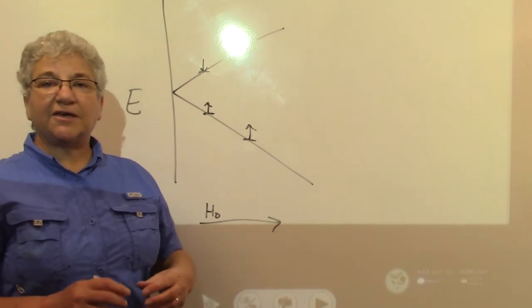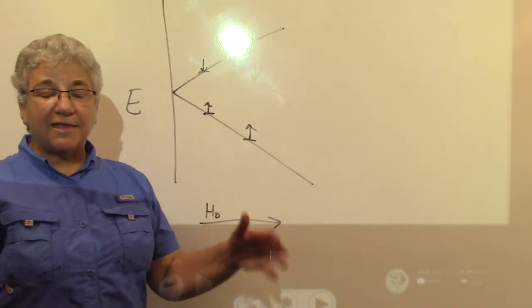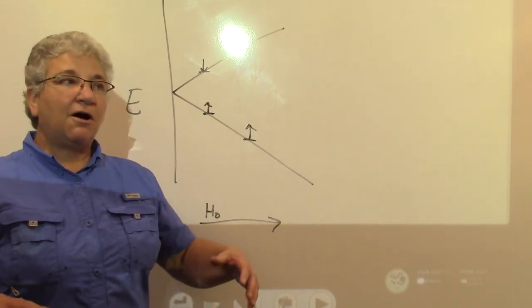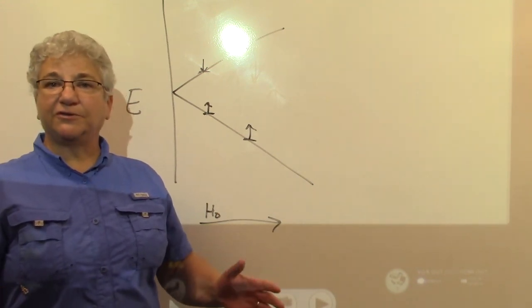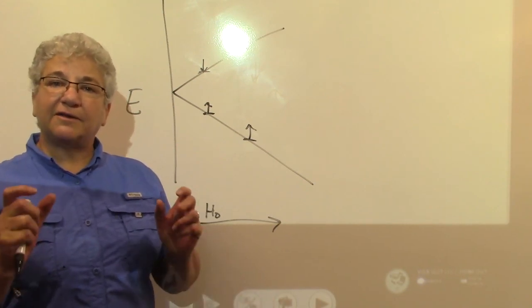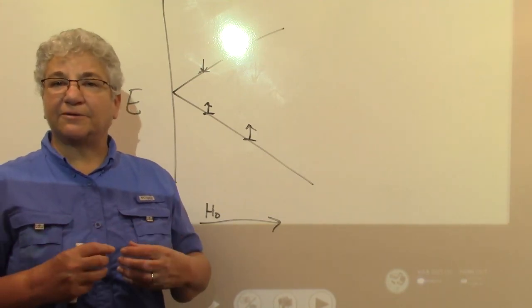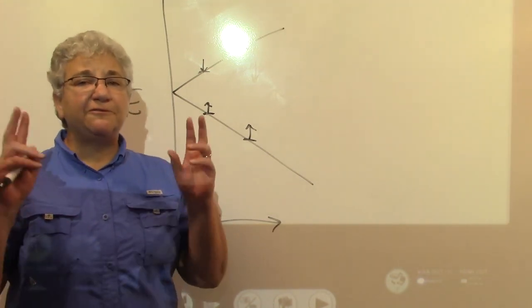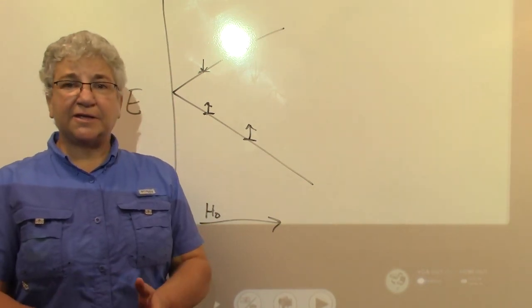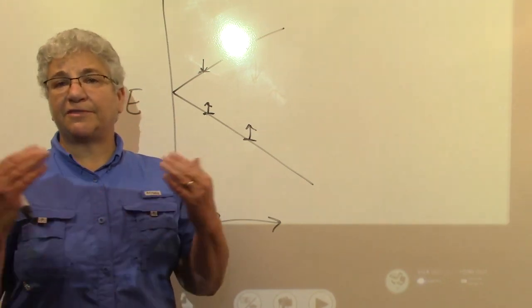I know you're taking your sample and putting it between the poles of the magnet, and that magnetic field is stable and steady, and you would think all of those atoms are going to feel the exact same magnetic field. The truth is that they don't. The magnetic field that an atom, that a carbon, actually feels in a magnet depends upon the environment that carbon is in.